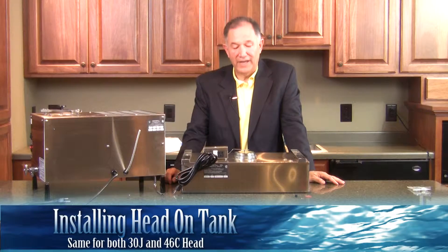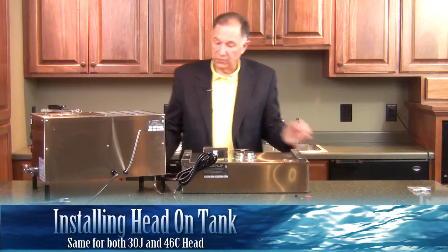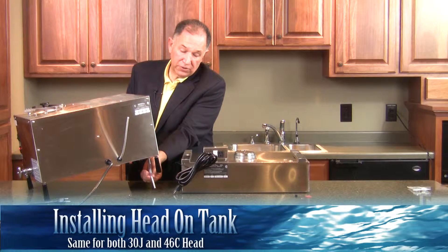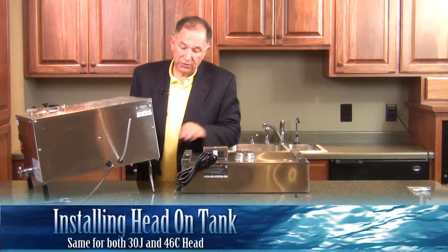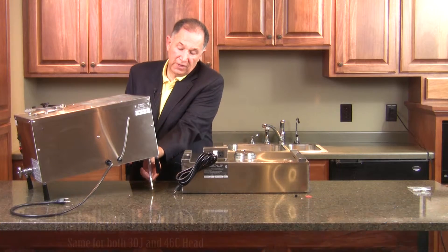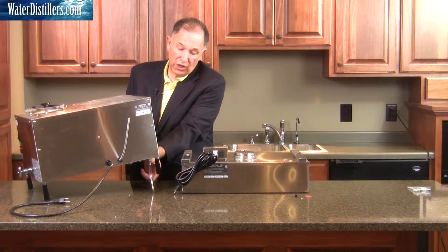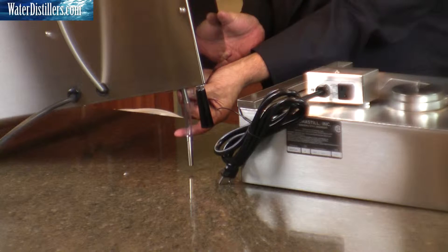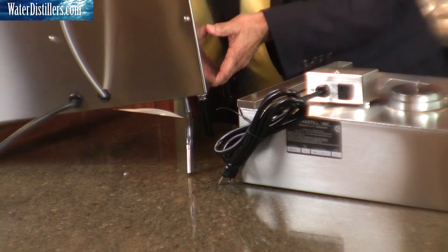Now we're ready to put the head on the tank. To refresh you, we had a stem longer here before. This one is actually set up for the smaller tank, so there are two different lengths. The one you saw earlier was longer than this. We're going to be putting the shorter tube so that you can see where it goes — this is the appropriate length for that.